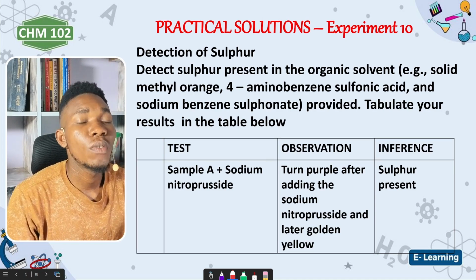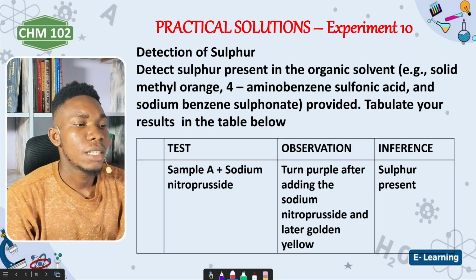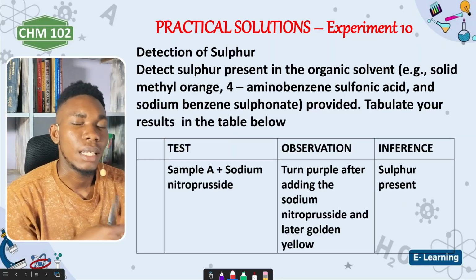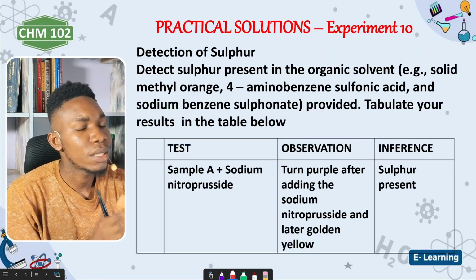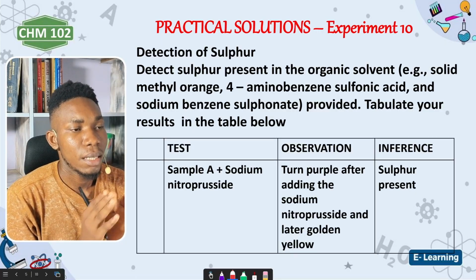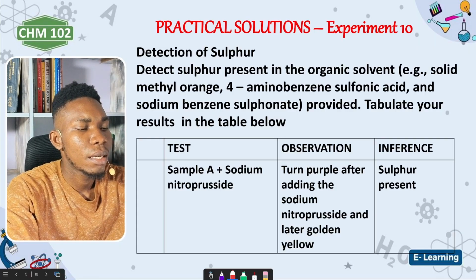When I say theoretical value, I mean from what we know beforehand, that this thing is supposed to be like this. Do you get it? But what they might have given to you is not that good. So at the end of the day, you might be getting results that are a little bit different from what is expected. Report it as it is. Is that okay? Now, let's see the next one.